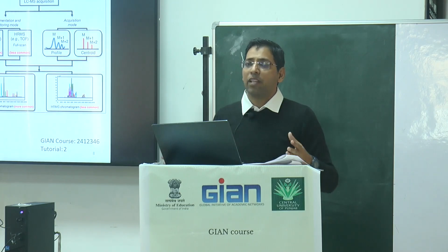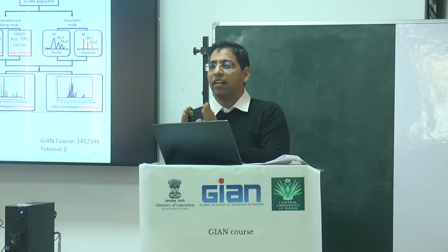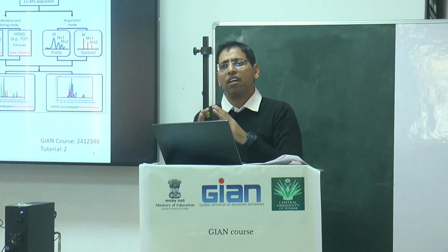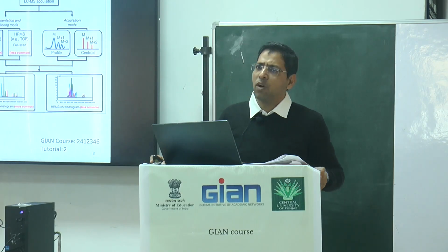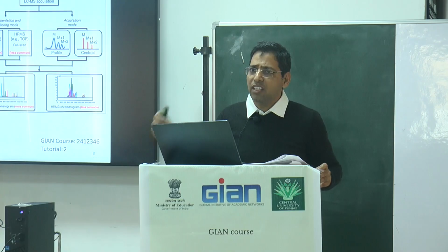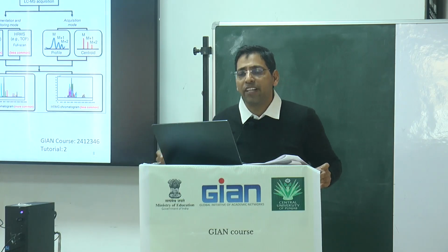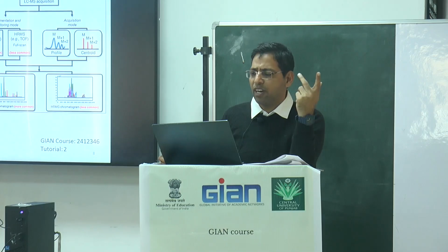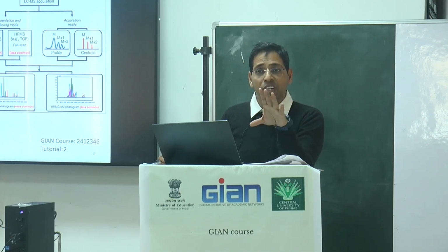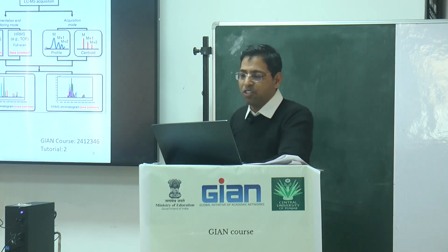Sometimes we work targeted, sometimes non-targeted, and sometimes we use an interdisciplinary approach in which we work on targeted and non-targeted together. In those cases you have to define the mode, but for targeted work you go ahead with the profile, though centroid gives some loss of the data. So we are using profile, but in some cases only centroid is preferred for data acquisition.